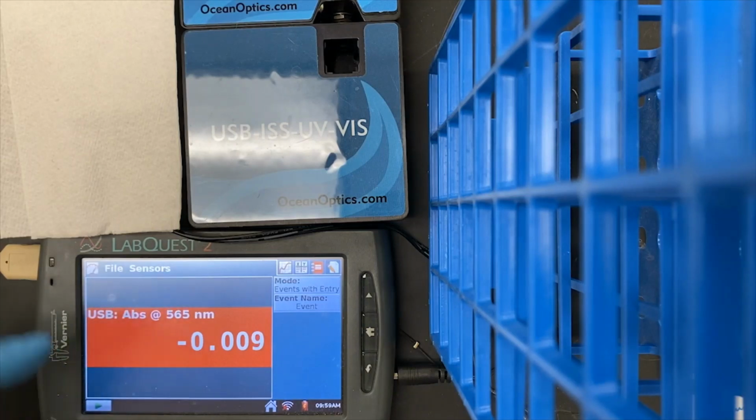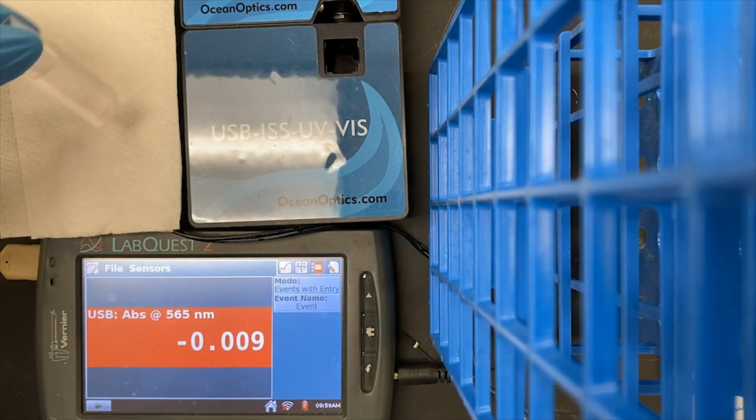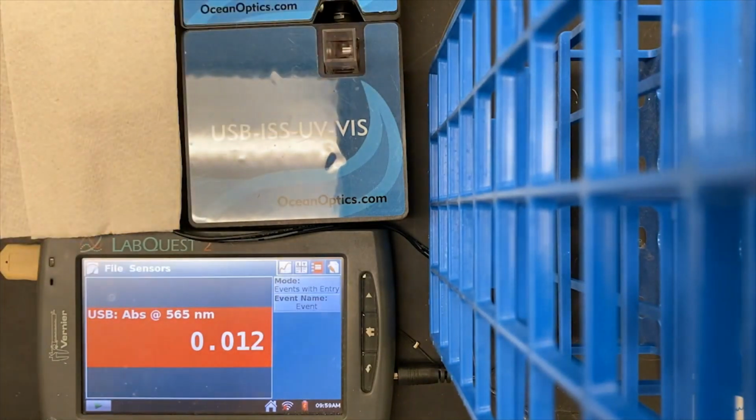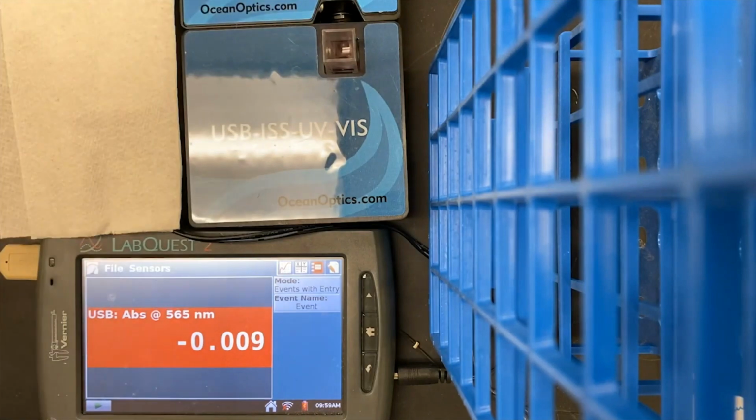And I don't actually have to hit anything to record here. The first one I'm going to start with is known 1. So here's, just so you can get an idea of the color. Known 2, and I'm going to go in order from here.